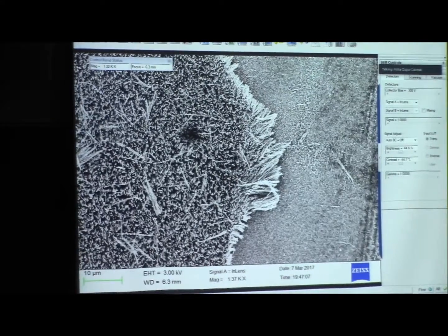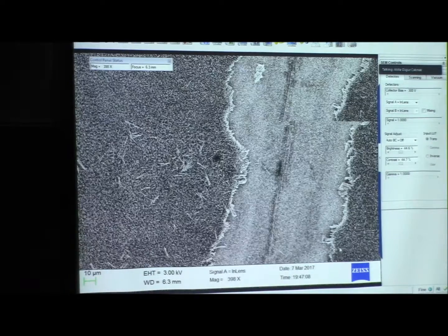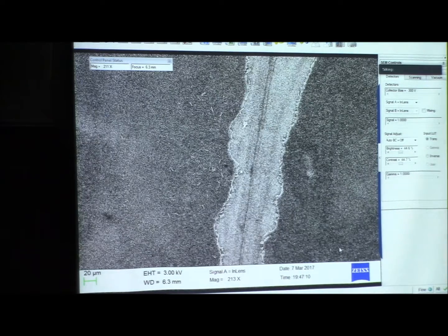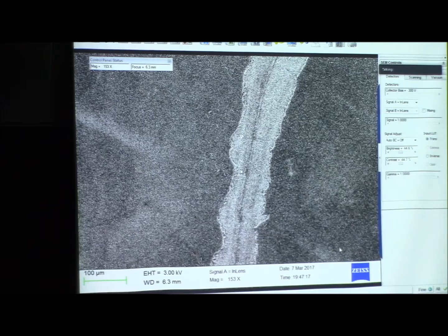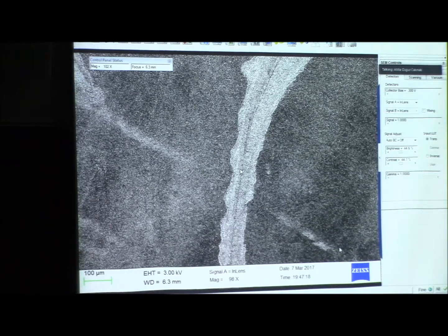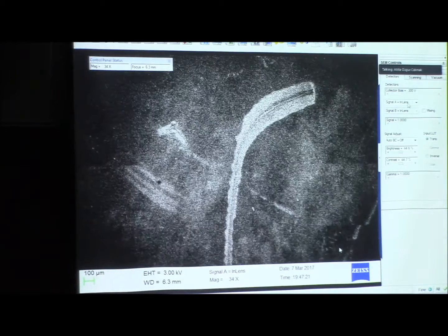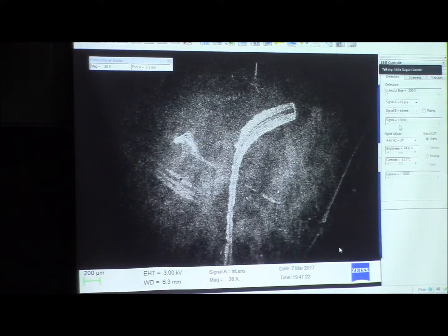So this sample, for example, carbon nanowires are conducting, right? So they're good to look into with this SEM. But if we have some organic samples, like for example the butterfly wing, or the next thing that we're gonna look at. Abdon? Yes, hi.